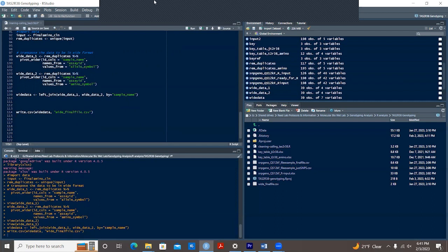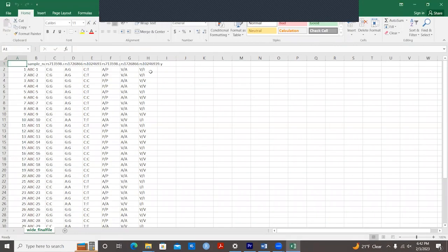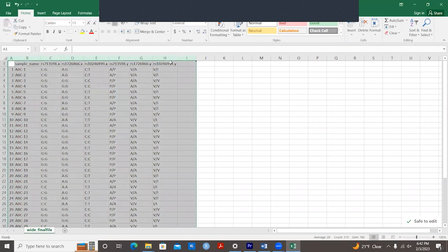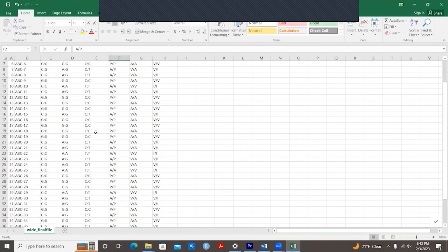And I'm going to open that in the actual CSV form. So I always save my project. Save and everything. And I'll X out of here. Save again. Save, save, save. And then, yeah, here's our thing that we downloaded last. This is our last guy. Okay, cool. So you can see here, or you're going to see it'll tell you like, oh, this came from the one data set and this came from the other data set. So they're calling them X and Y. But I would just change these to be like 713, 598 amino acid. Or whatever. But you change your table to see how you fit.